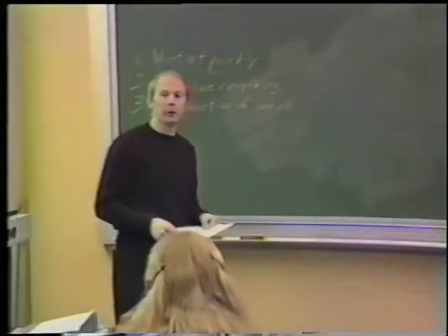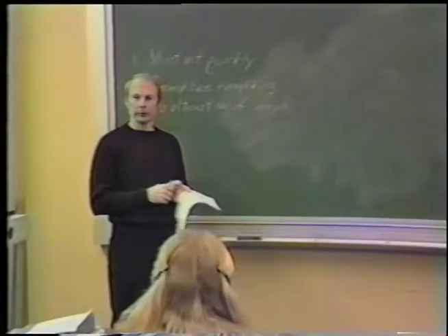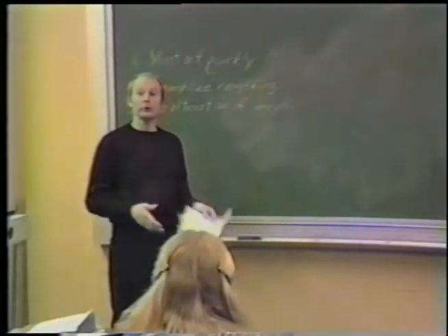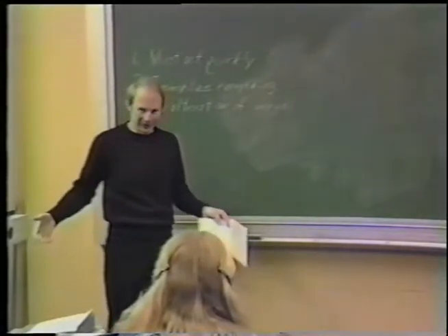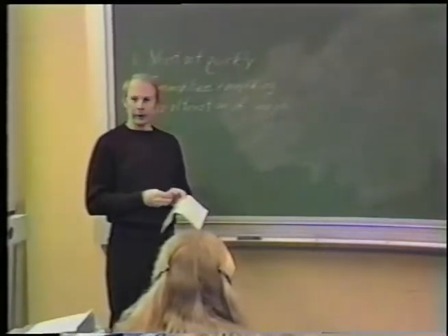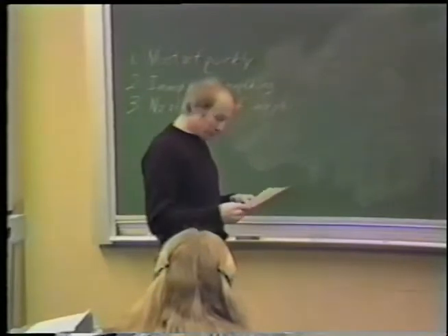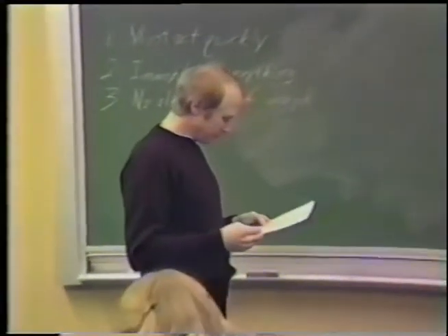Okay, it was actually developed by Hans Moor in Switzerland. He started in about 1968. He finally got to the point about 2 years ago where it was ready to be made into a commercial prototype. Balzers has made 3 prototypes. One is in Moor's lab, one is in Andrew Staehelin's lab at Boulder, one I've been working with, and the other one fell off the loading dock. You're building some more. Okay.